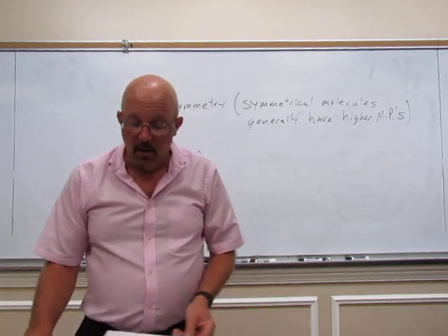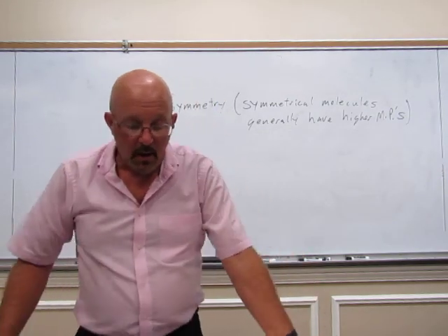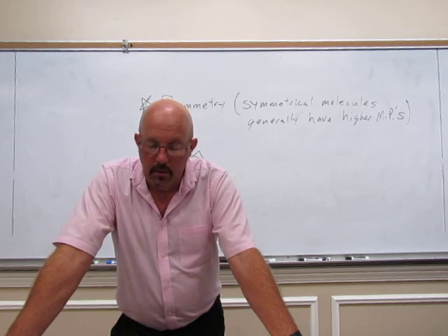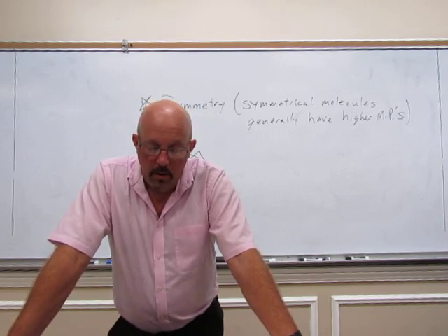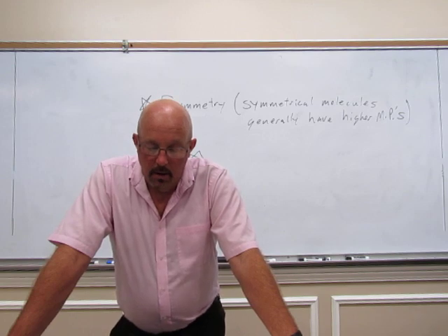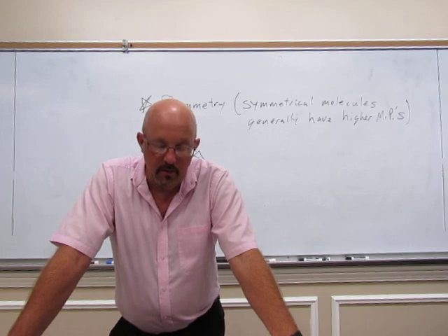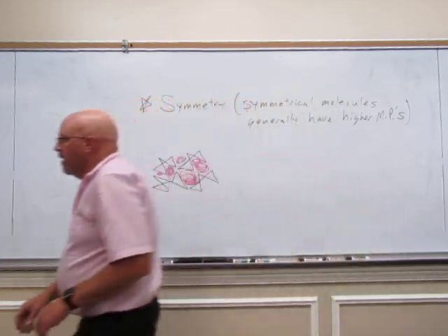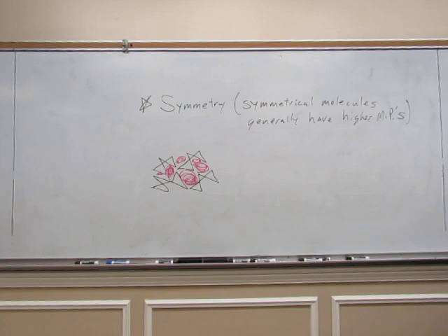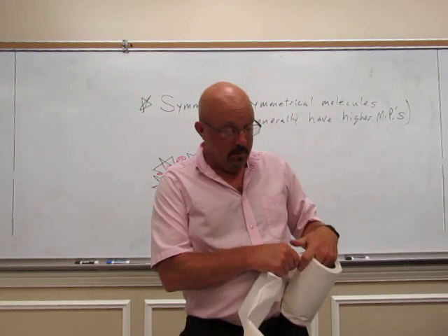Okay, now let's take a look at our procedure here. So much of this I've already talked about. We are dissolving the compound in a minimal amount of solvent at boiling. And then after we let it cool, and we want to cool slowly, the best way to cool slowly is to take some paper towel.